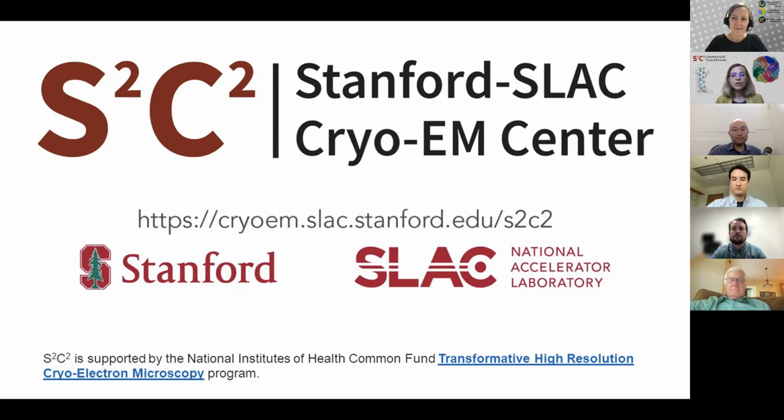We have 5 full-time CryoEM specialists, as well as IT experts and administrative staff to support all steps from shipping dewars through booking instrumentation, advising users, clipping and loading samples, performing fully supported data collection, advice on data processing, and of course, tending to the smooth operation of instrumentation, which is often challenging. Of course, I didn't mention our leadership consists of Wah Chiu, Mike Schmidt, and Brett Hedman.